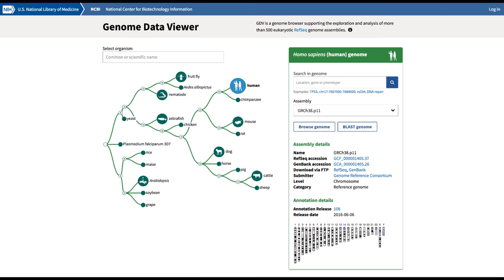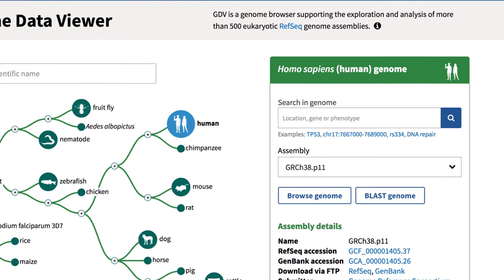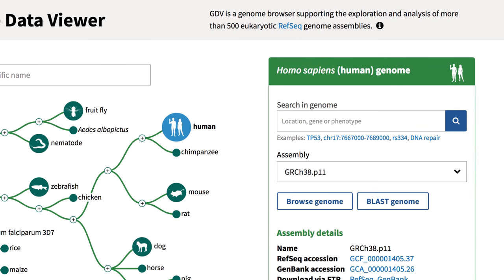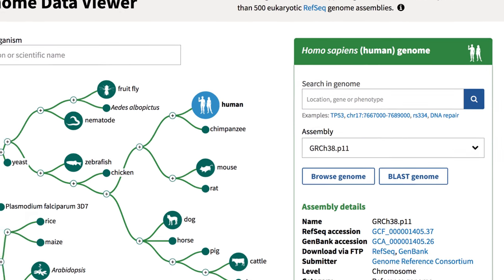Let's take a look at NCBI's newly enhanced genome data viewer. You can now view and analyze more than 500 eukaryotic reference sequence or RefSeq genomes. Take the next two minutes to discover the GDV's versatility.